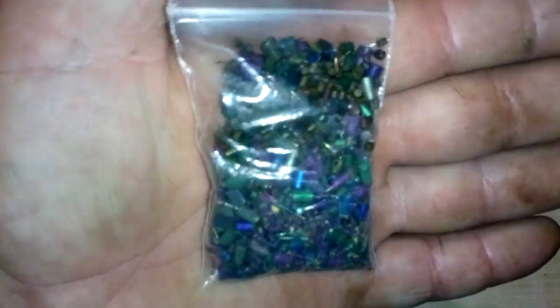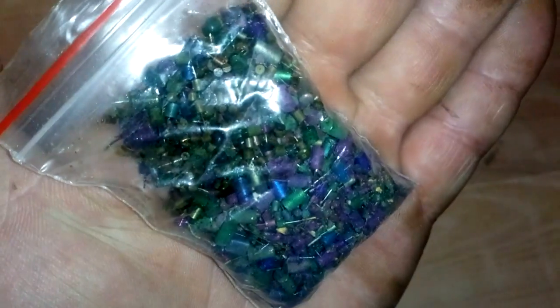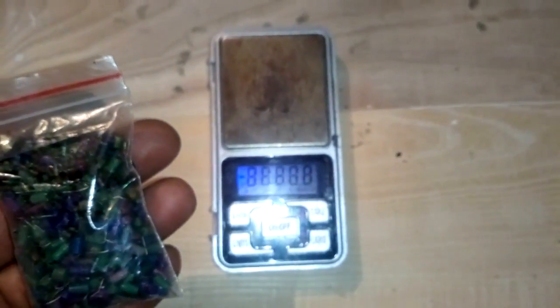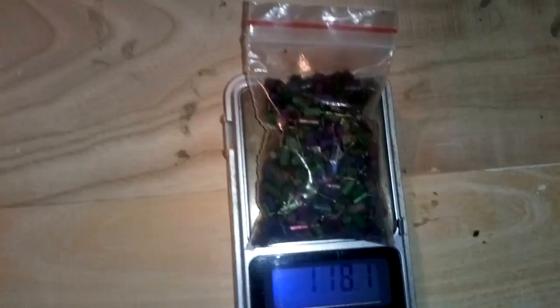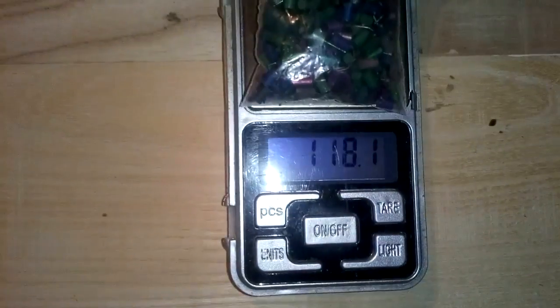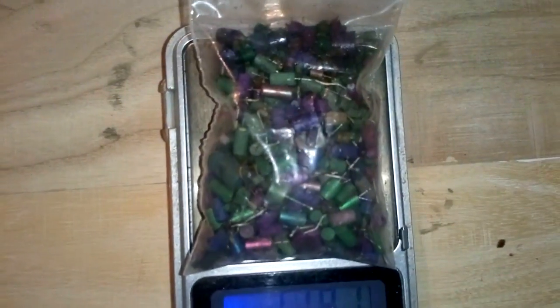On the end, I put together all my tantalum from this tube process video. Look — it's very beautiful. The total weight from all of this tube process is 118.1 grams — that 0.1 is probably the bag — so 118 grams of tantalum.